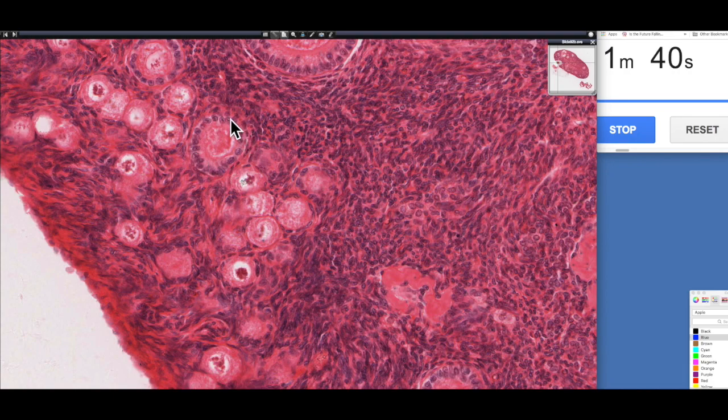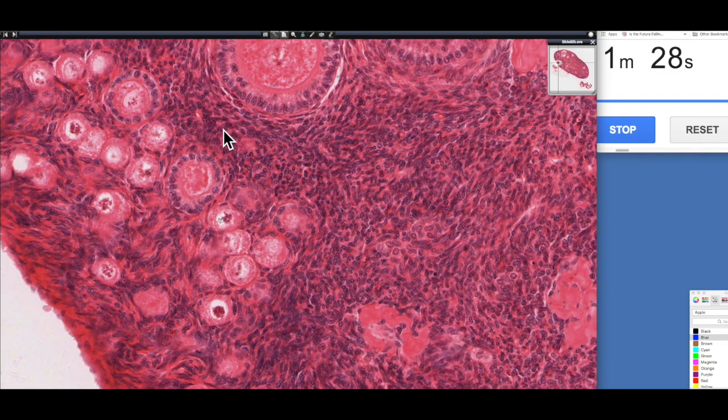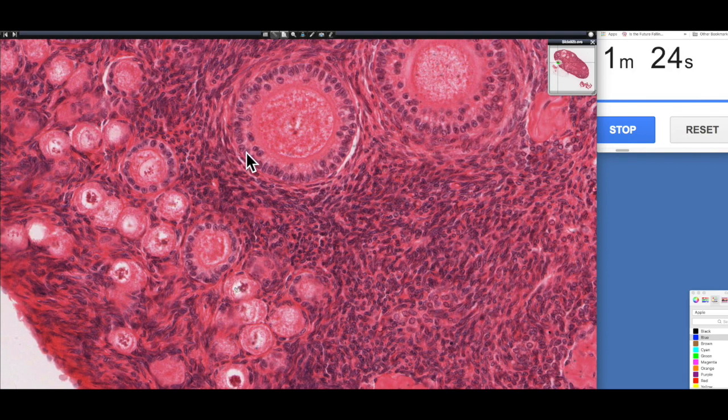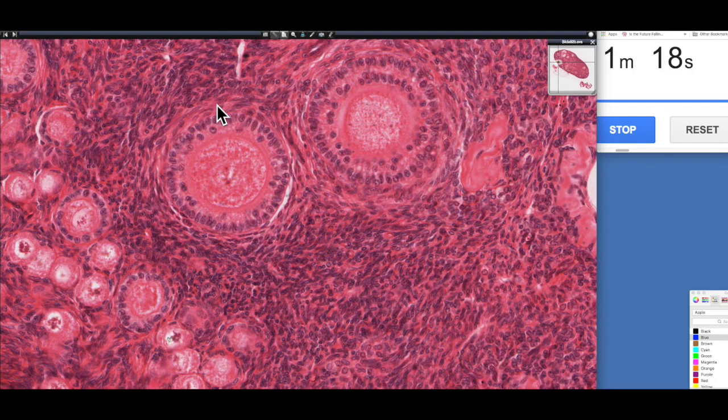Now, sitting on the outside of that, the granulosa cells are actually sitting on a basement membrane. You can't really see it in normal H&E staining conditions. And then external to that, we have the stromal cells. And the stromal cells actually begin to differentiate as the development grows as well. So here's a multilaminar. So this is a unilaminar primary follicle, and then here's a multilaminar primary follicle. So here's our oocyte. You can see it's increased in size quite considerably.